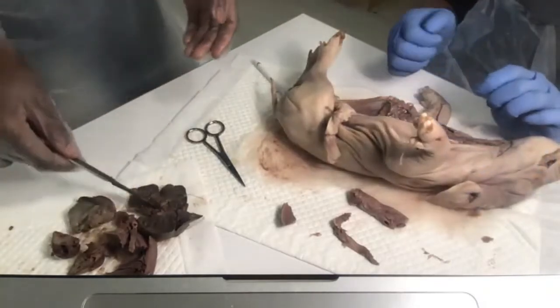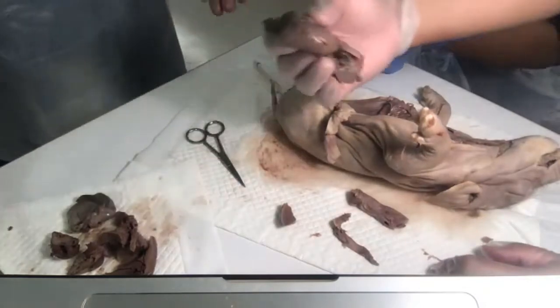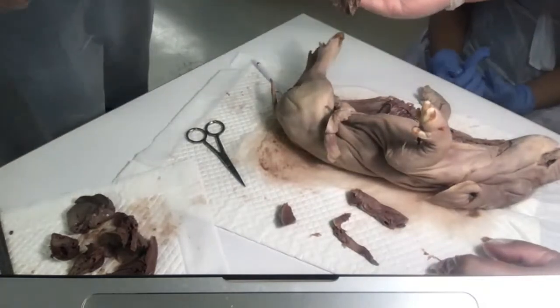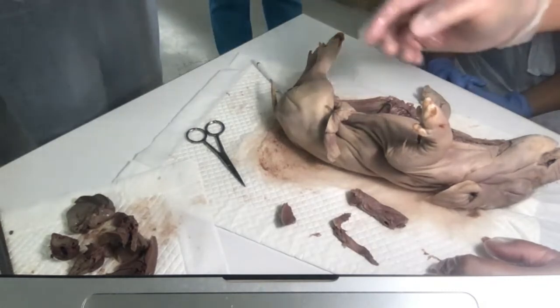Okay, so you said the liver and the stomach. Let's look at this liver. Again, it's in lobes, just like the lung. We open it up and we all feel the consistency. It's weird. It's like spongy. So everyone pass it around and look at that.